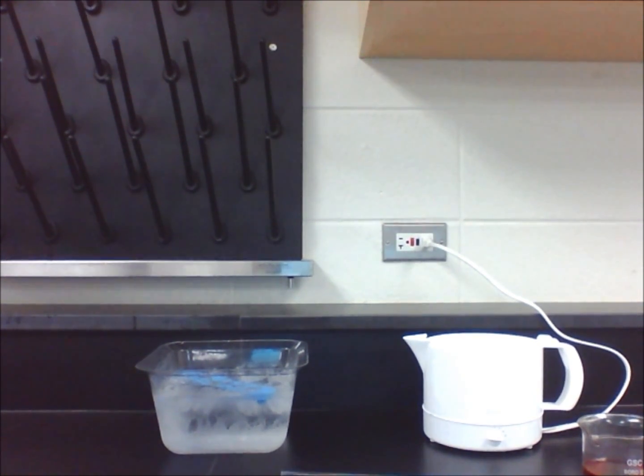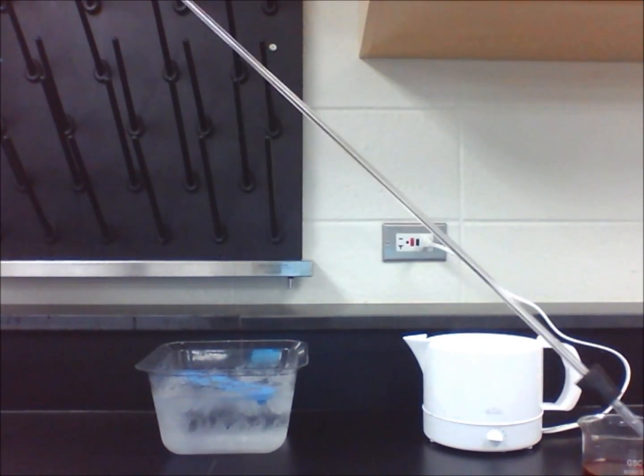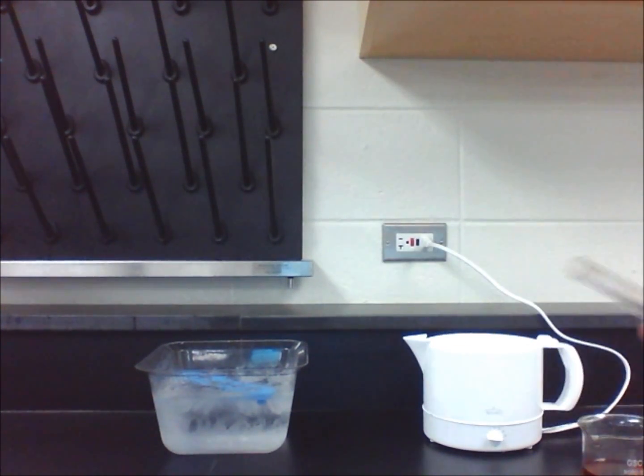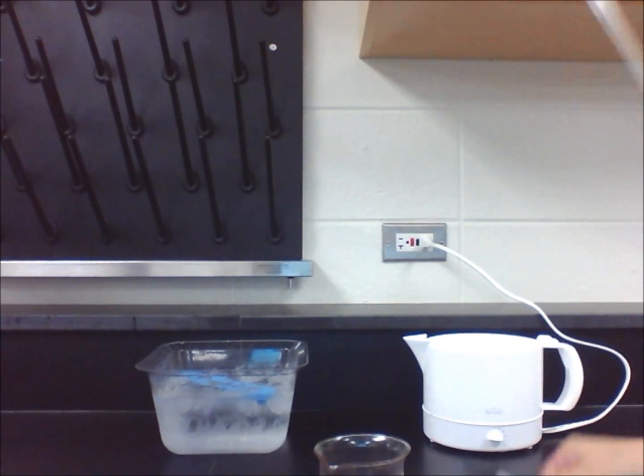All we need to construct a simple yet functional thermometer are a piece of plastic tubing mounted in a stopper, a test tube, colored water, permanent marker, and a metric ruler.